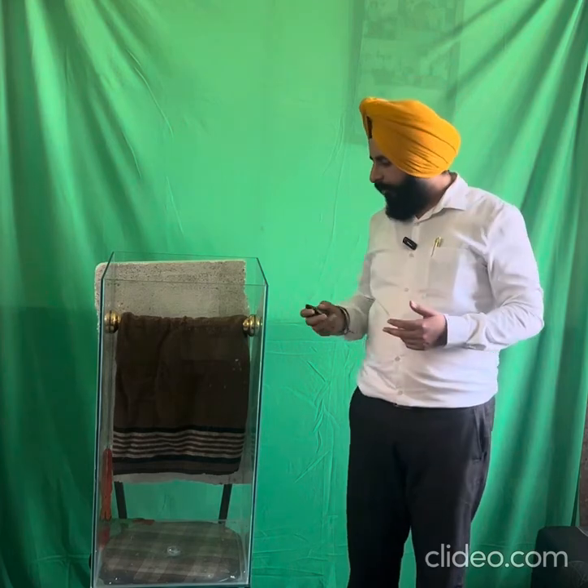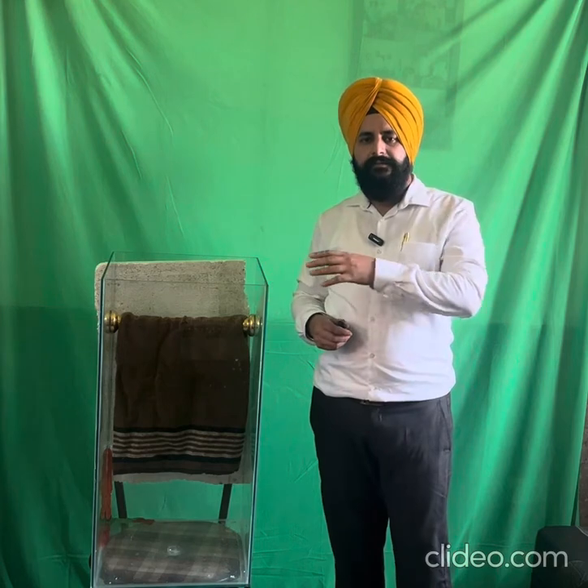In case of the rotor rod, there is a need for extensive training and if the rotational speed is high, it creates problems for the rat. Here there is no such problem. That is why this novel apparatus — the Strength Glass Chamber Test — is useful for checking rodent activity.